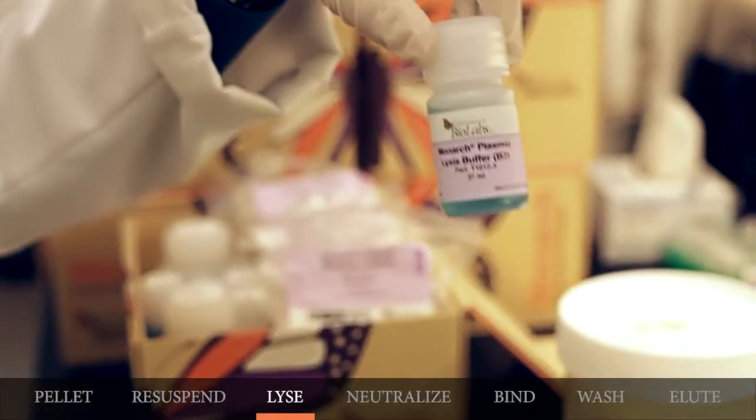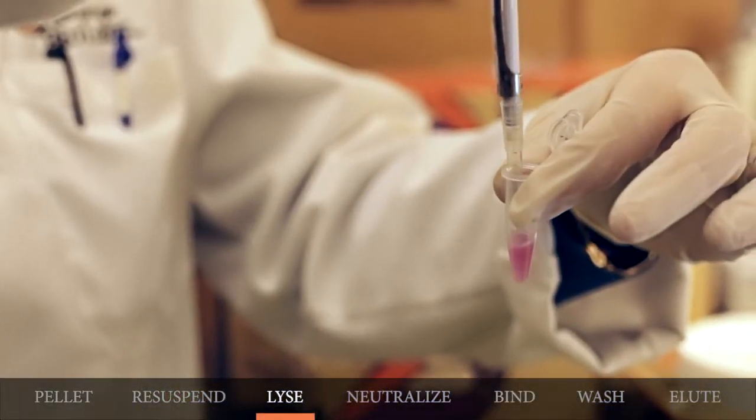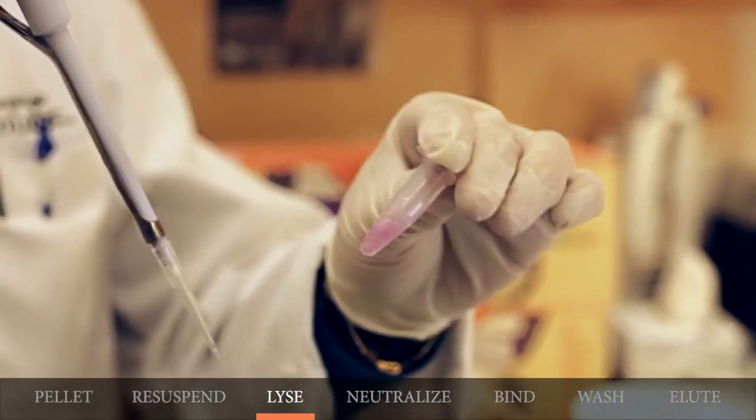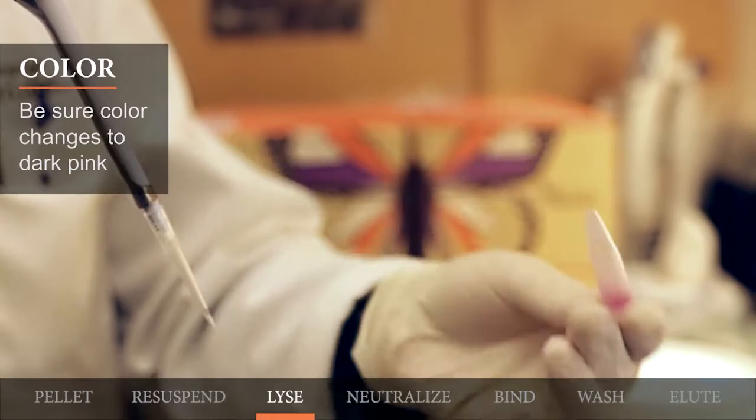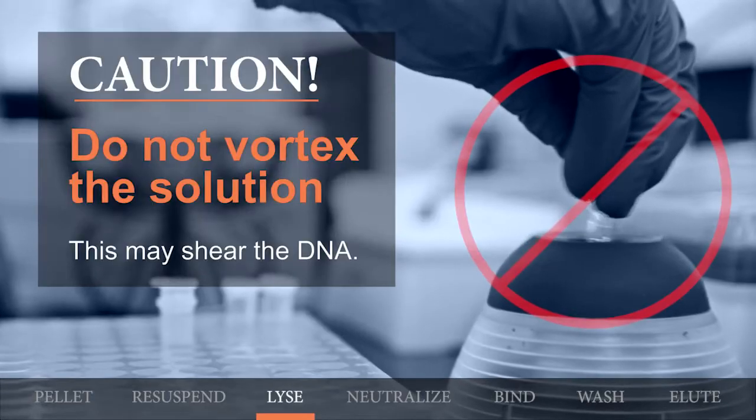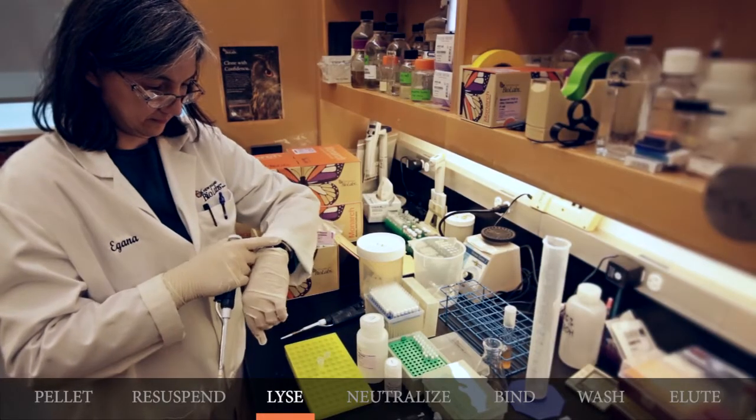To lyse the cells, you will add 200 microliters of Plasmid Lysis Buffer B2 to the cell suspension. Immediately and gently, invert the tube five to six times until the color changes to a dark pink and the solution is viscous. Please do not vortex the solution since this can shear the DNA.